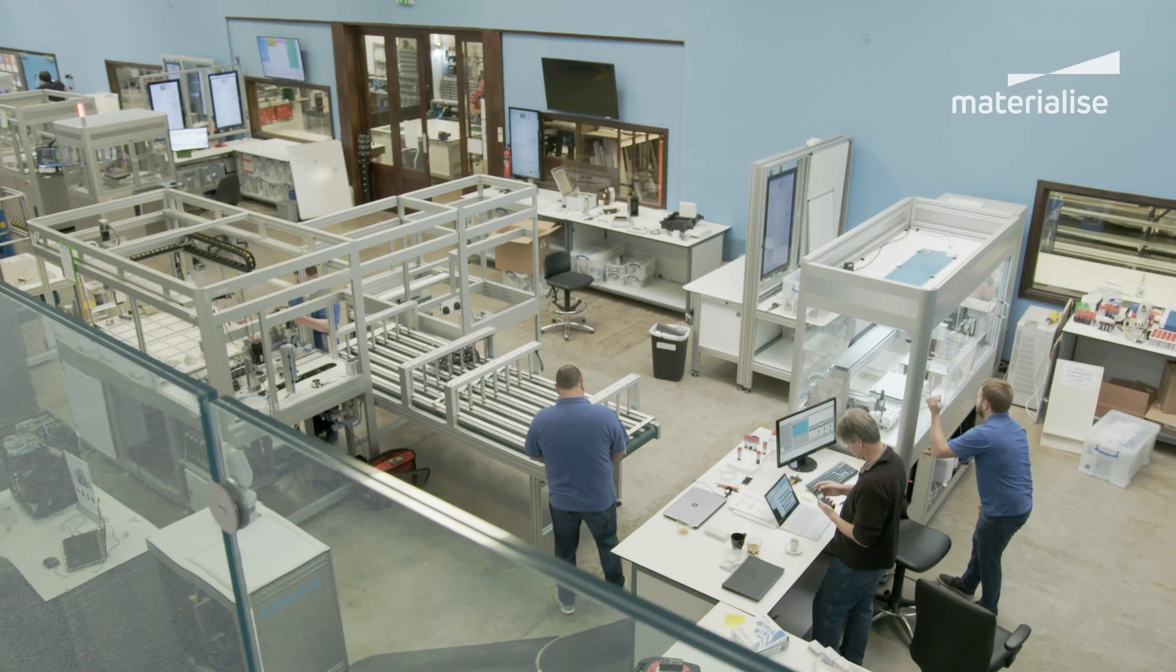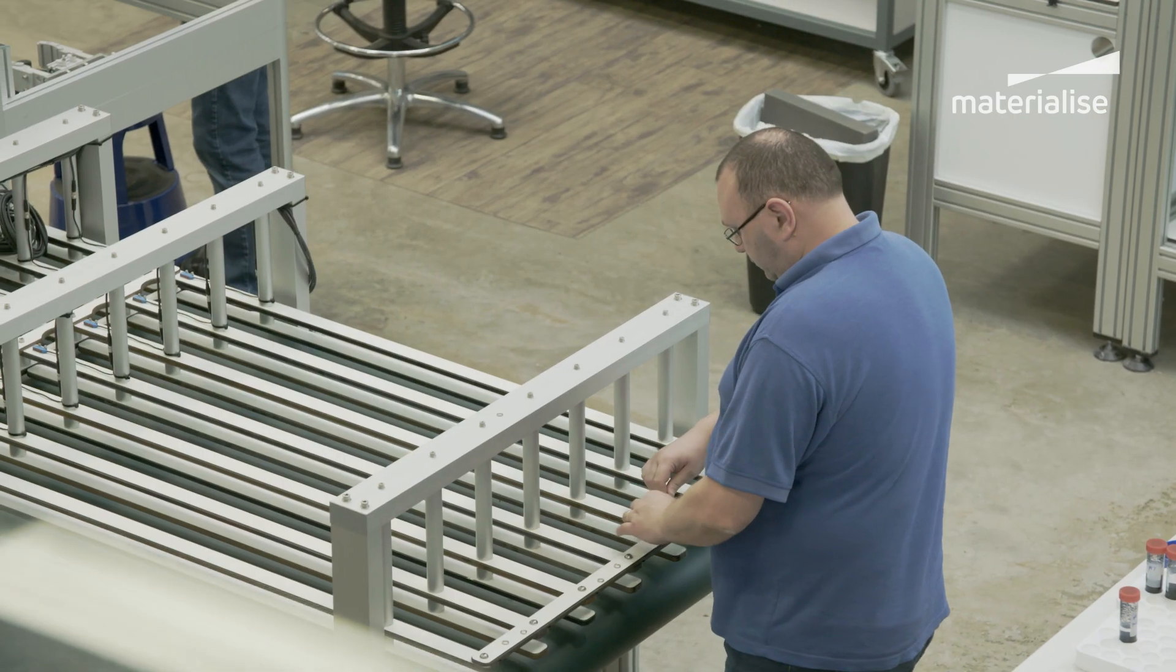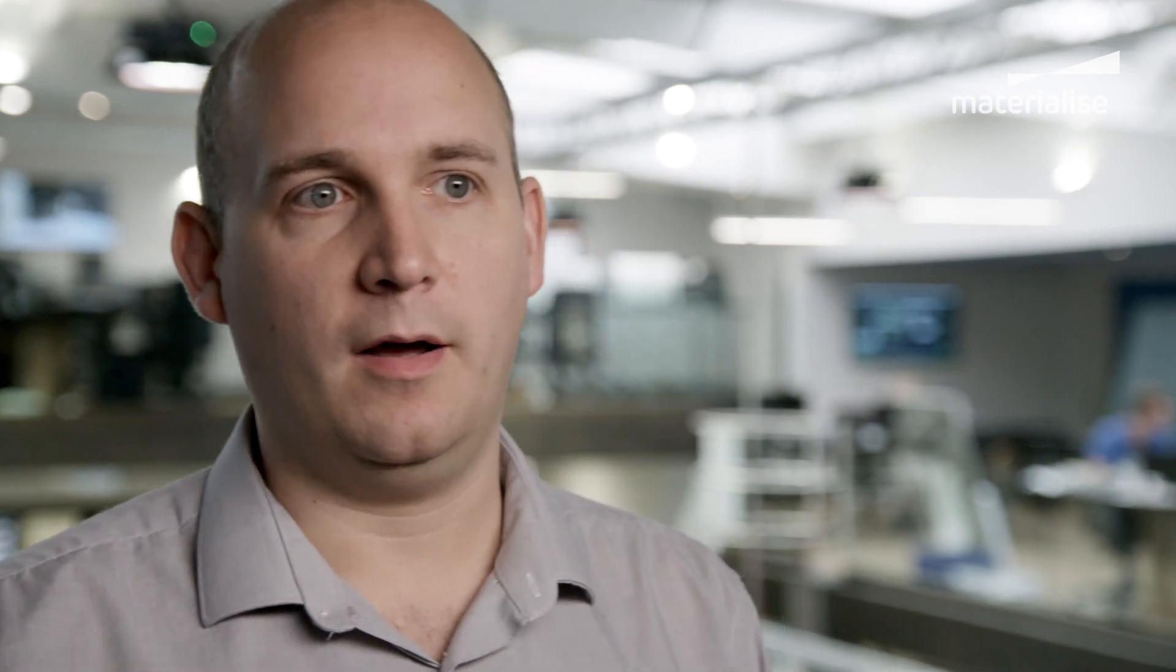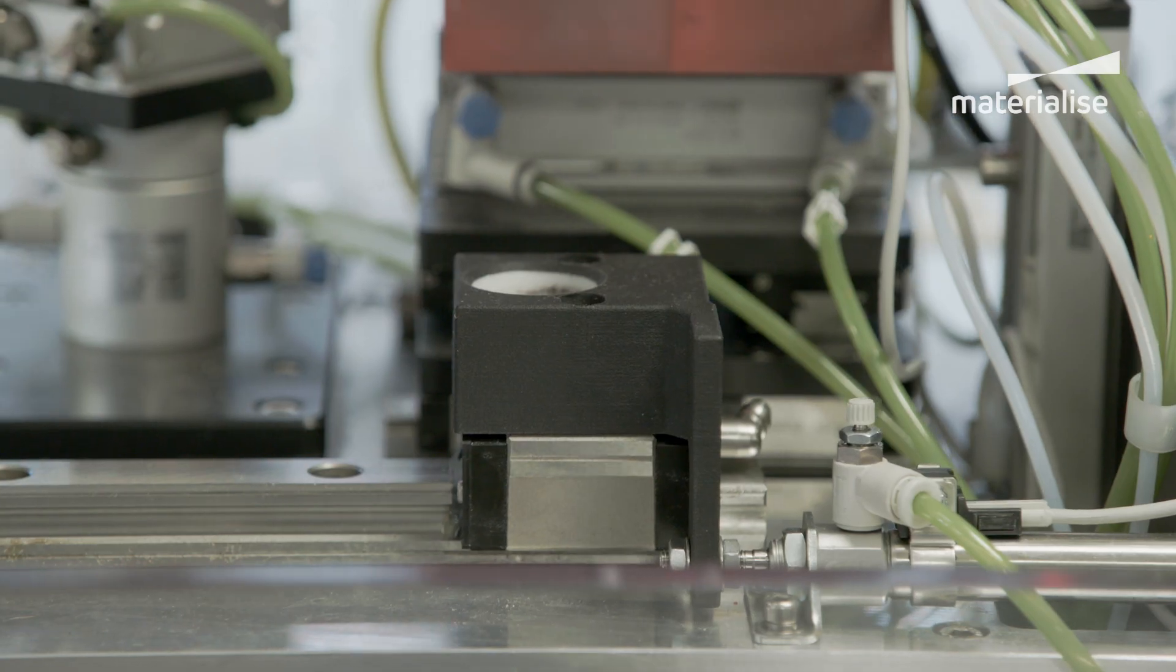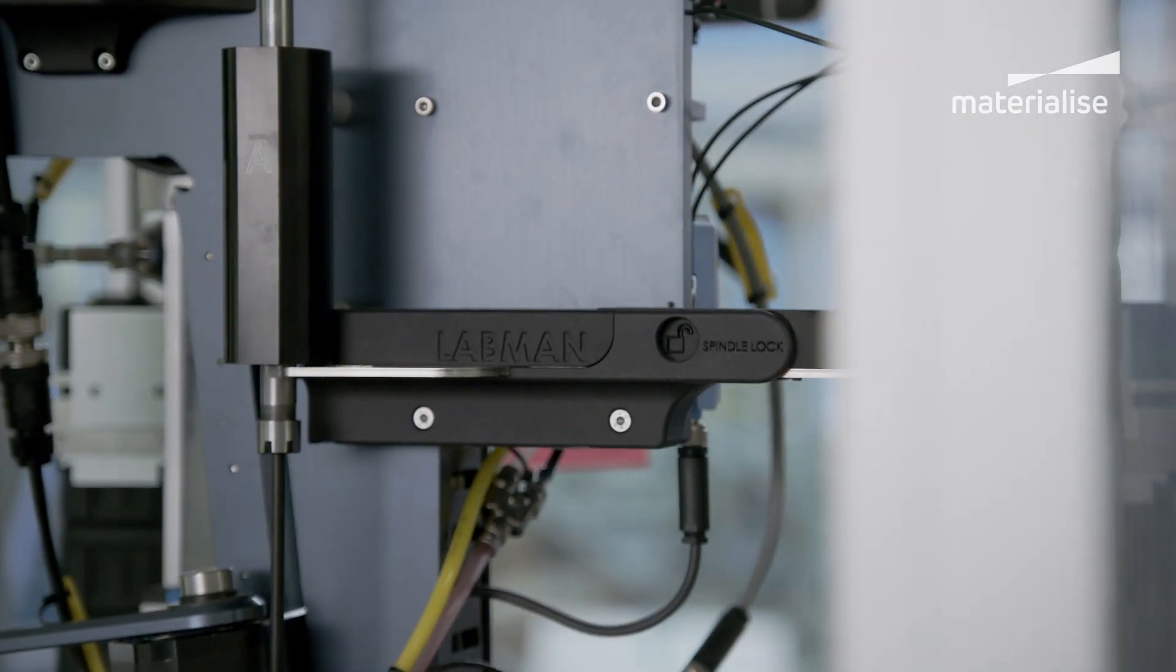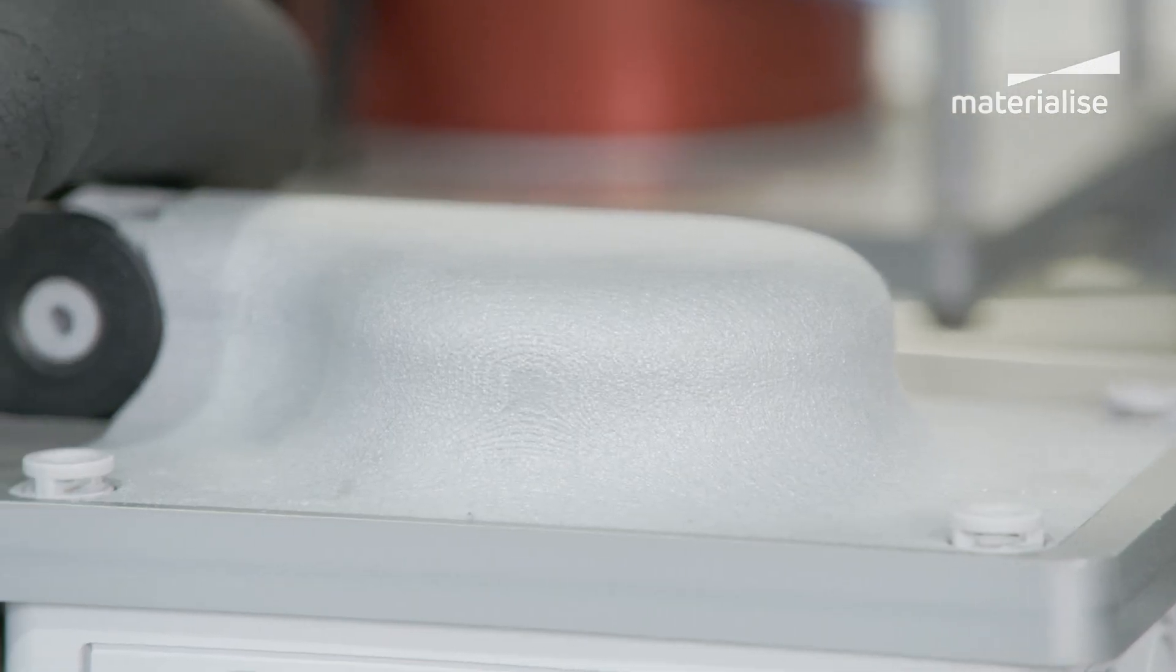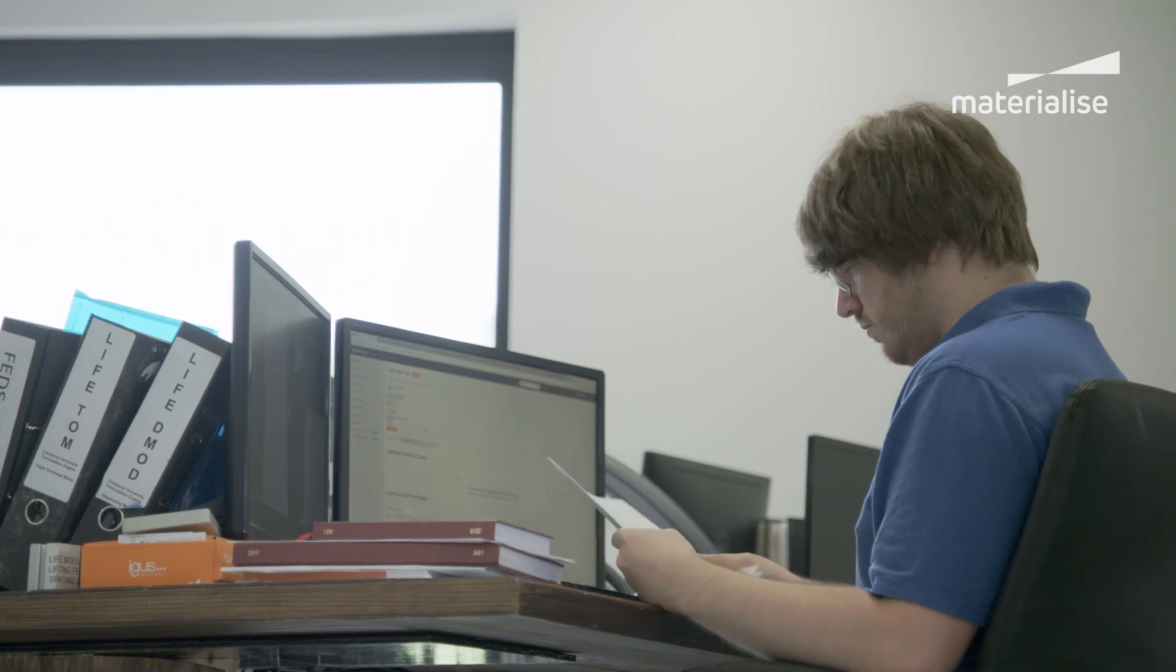There's two parts where we're using 3D printing. We use a lot of it in the traditional sense, so at the beginning of a project where we want to give the customers a hands-on feel for what that part of a robot might be like, we'll use printing in that instance. But we'll also use it increasingly during the production as well because typically we're building one, two, three off items, so it's a real opportunity to use 3D printing.